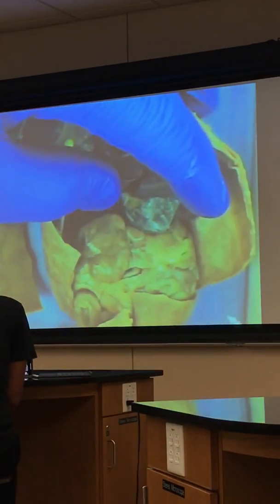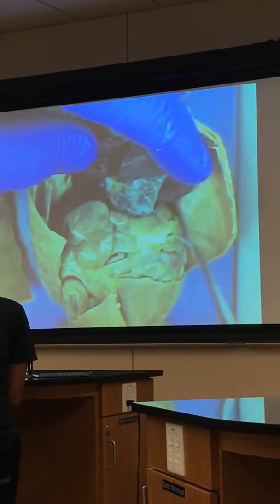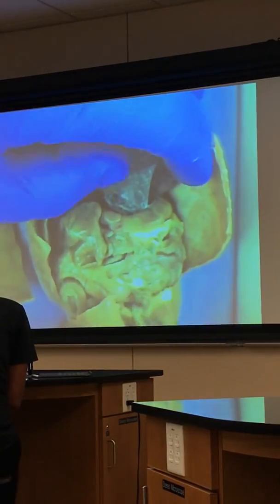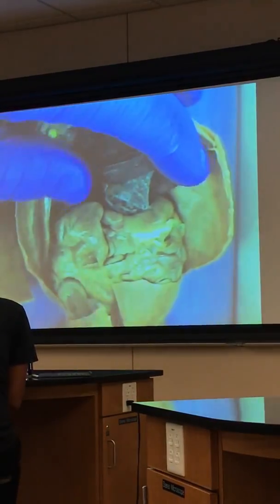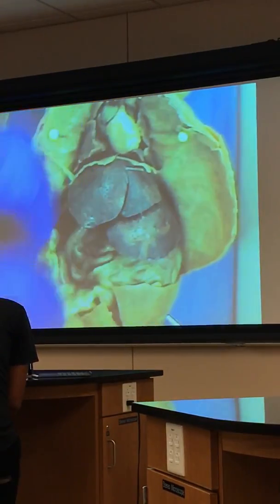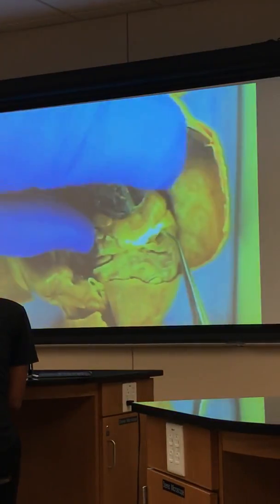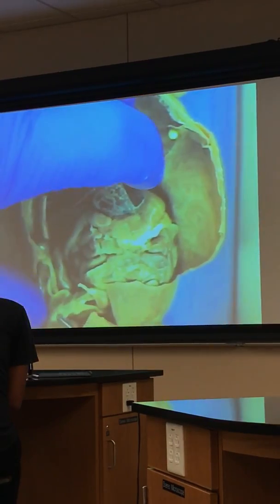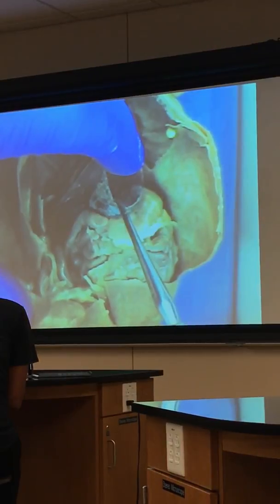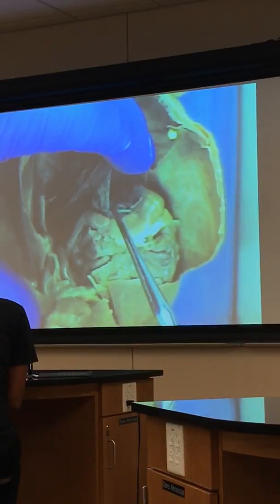So, you guys see the connective tissue right here? Right. And so, as you come down through here, oh gosh, notice how this guy has got a lot of fat everywhere. This guy really messed up. Right? All right. That's a big old cecum right there. So, you guys see that connective tissue? All right, so you can feel that, it's pretty tough.